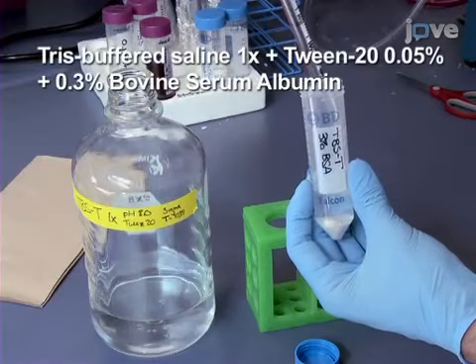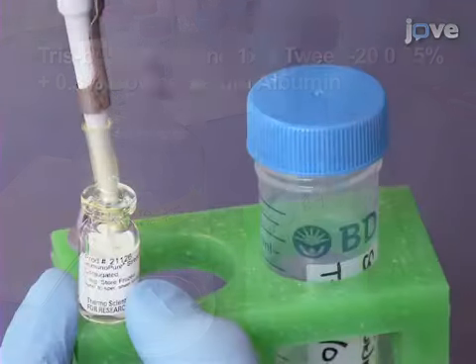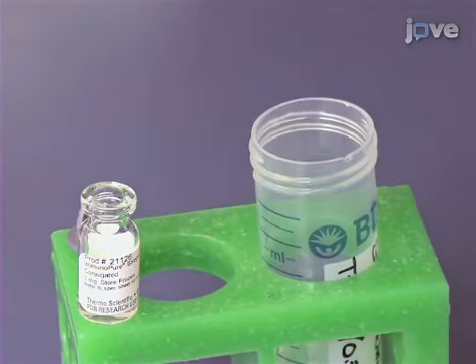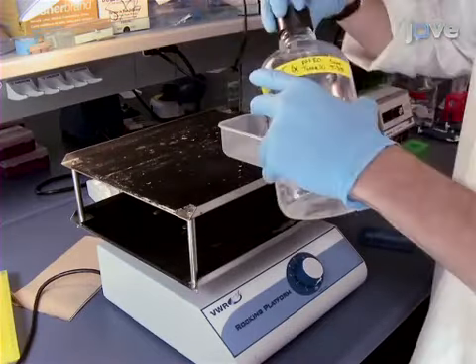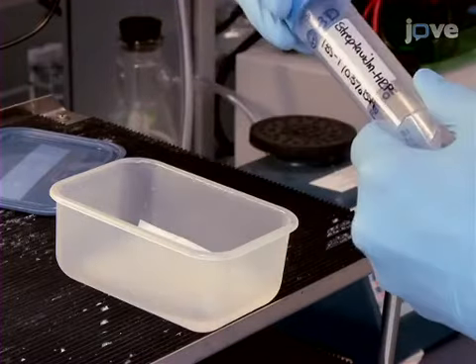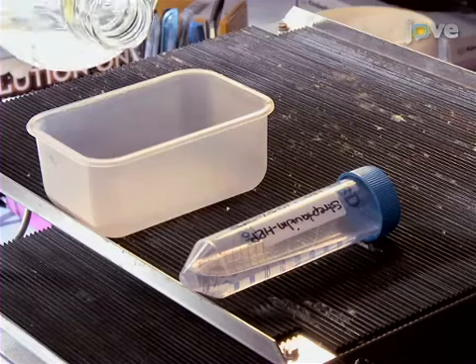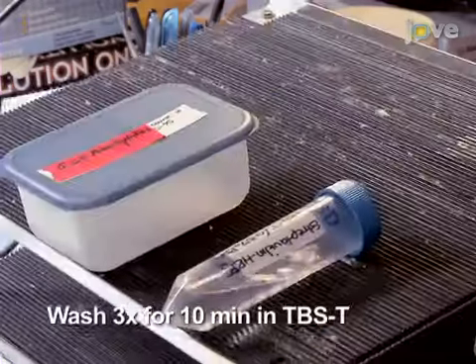Prepare an antibody solution of TBST plus 0.3% BSA. Add streptavidin HRP antibody, which has been reconstituted at 1 mg per milliliter in distilled water. Wash the membrane once in TBST for 10 minutes. Then, incubate the membrane in streptavidin antibody solution on a rocking platform for either 1 hour at room temperature or overnight at 4 degrees Celsius. Wash the membrane 3 times in TBST for 10 minutes on a rocking platform.